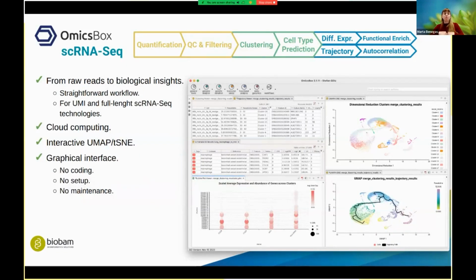CellKB is part of the whole OmicsBox single-cell RNA-seq pipeline that covers everything from the quantification down to biological insights, so you can start right from your raw reads. It supports both UMI-based technologies like 10x and Drop-seq, or full-length ones like Smart-seq single-cell RNA-seq. And all the computation is performed in the cloud, so you don't really have to worry about the computational resources of your local computer. It also includes an interactive UMAP/t-SNE viewer, in which you can explore your data, select the groups of cells that interest you, and perform custom annotations.